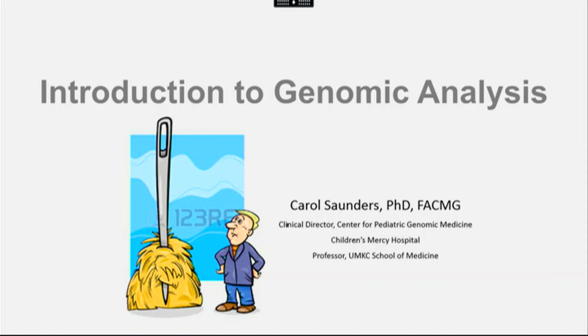So I'm here now to walk you through how to look at bigger data, like an exome. Yesterday we did the targeted panels, which have a lot fewer variants than what you'll see today. Can you hear me?